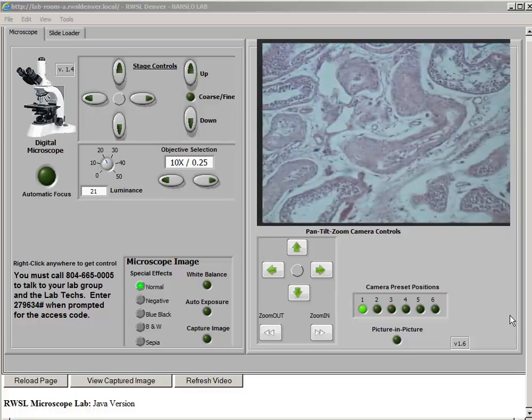For example, if a specimen is viewed through a 40x objective lens, the magnifier in that lens displays the specimen 40 times larger than an equivalent view as seen by the unaided eye. Remember that the ocular or other lenses also add magnification. This microscope has 5 lenses: 4x, 10x, 20x, 40x, and 60x.